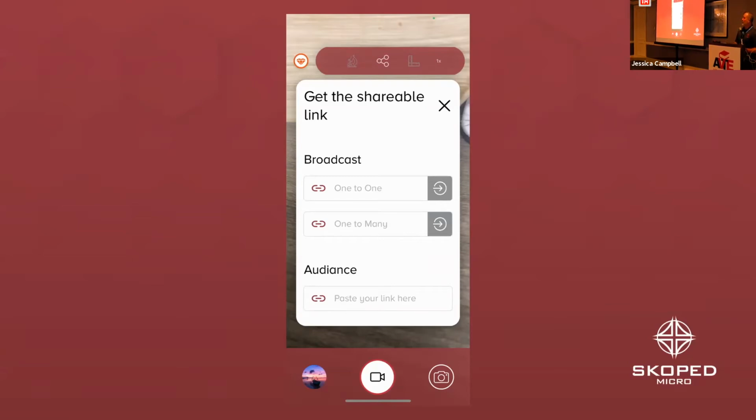That is what the broadcast ability has. On the one-to-many, right now we're talking through some different things, but on the one-to-many, you can talk if I'm broadcasting it, but they can't talk either, because I didn't want 100 kids talking in the background or hearing whatever's going on. Maybe you don't want to hear what's going on. So on the one-to-many, only the broadcaster is going to be able to talk, whereas the one-to-one is a two-way communication.